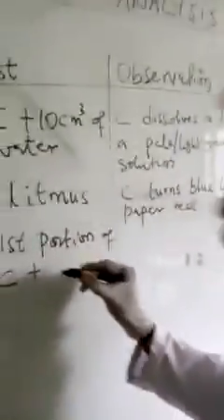So you report that in drops, or we can complete the test at once. Now let's add in excess. You can even pour it. See, this is when you see the color well now. Did it dissolve? No. Insoluble in excess. Dirty green precipitate, insoluble in excess. So first portion of C plus sodium hydroxide, NaOH aqueous. So what is our observation?